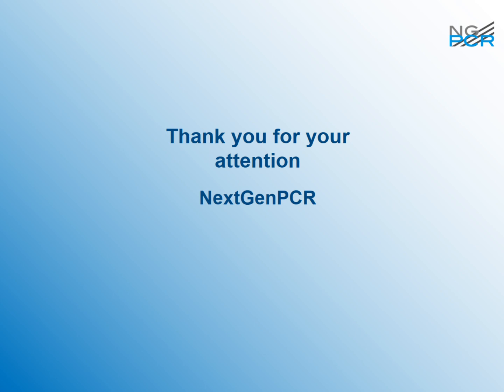Okay, brilliant. Is it possible to skip the extension step? Yes, this is probably meant to ask, can you do a 2-temperature PCR? And the answer is yes, you can. If you select 0 seconds for the extension step, it doesn't do the extension step. It goes between denaturing and annealing, and then it skips the extension step. I have to add that in our experience, because we virtually don't need any time to go from one temperature to the other, most assays are quicker using 3 temperatures.